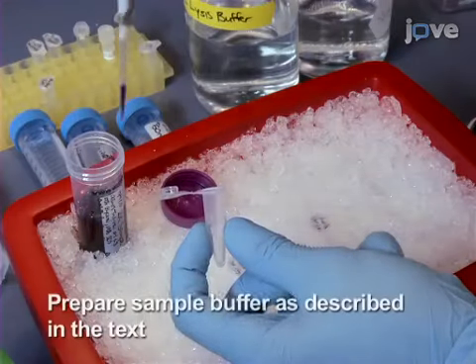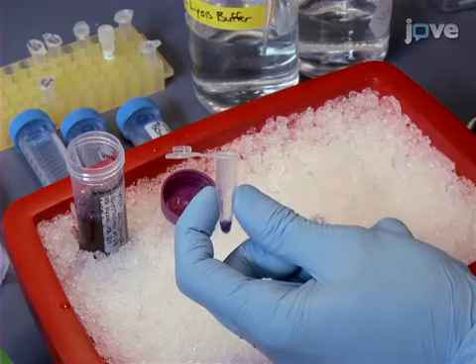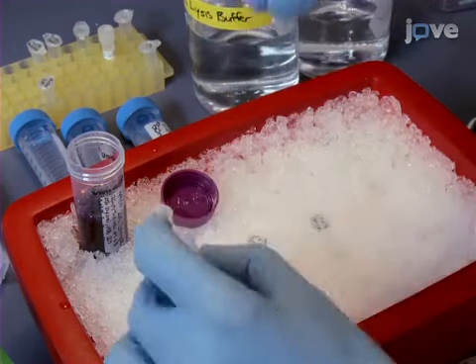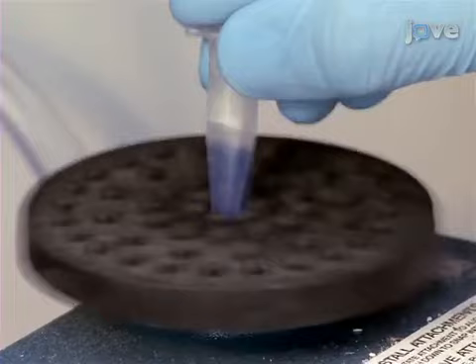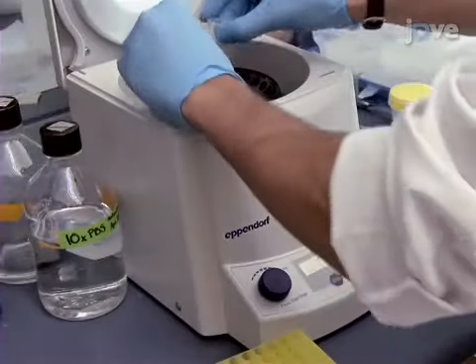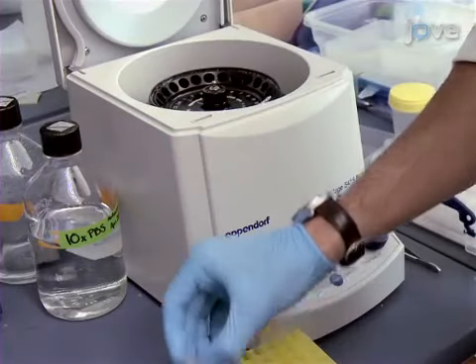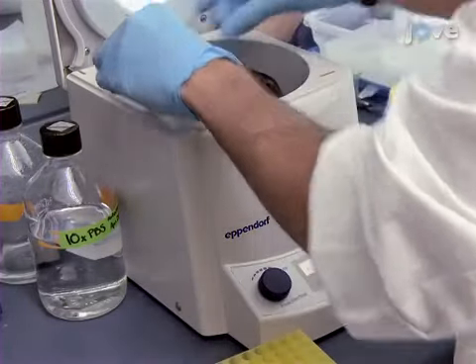Add 40 to 50 microliters of 2x sample buffer plus 5 millimolar DTT to each sample. If necessary, vortex the beads to completely mix with the sample buffer, and immediately centrifuge at high speed to collect all beads in a pellet submerged in sample buffer.